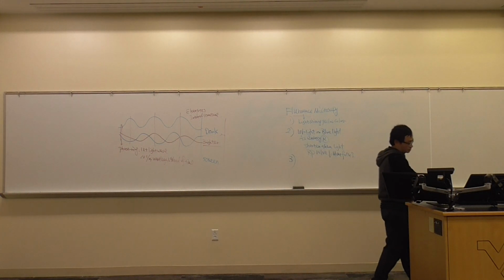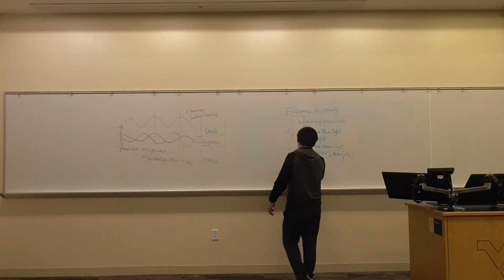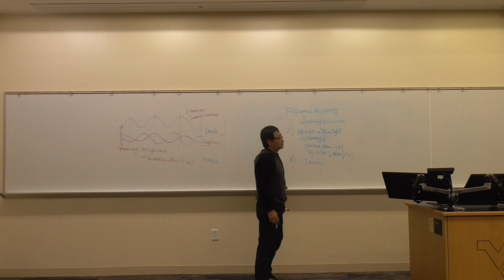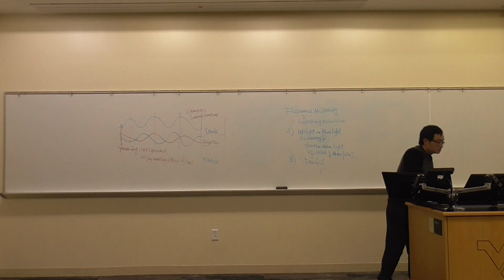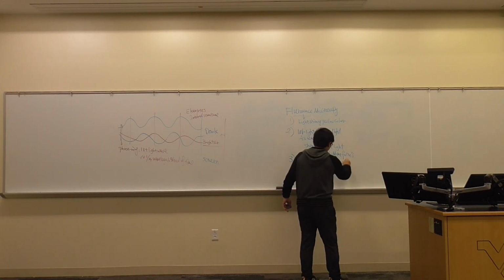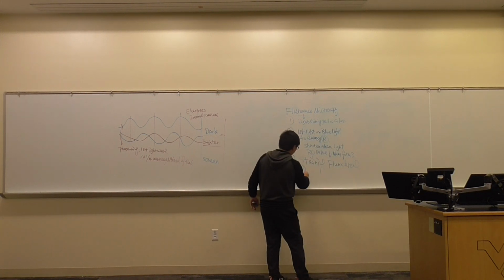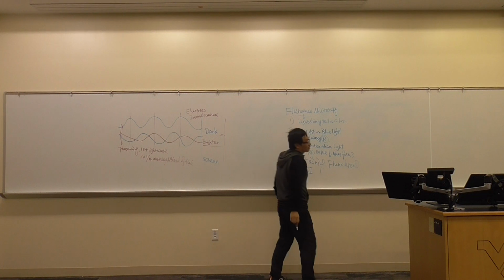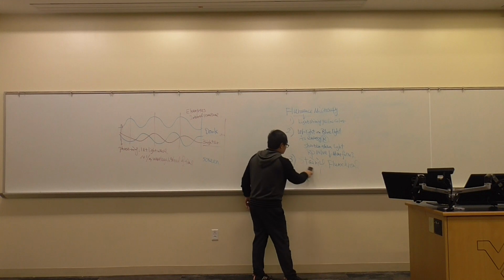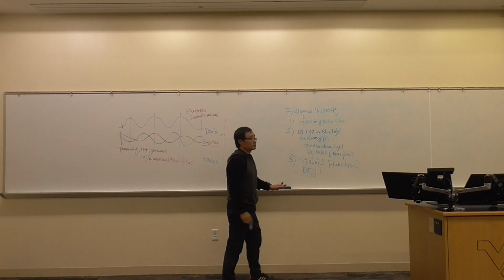The third thing I want to mention is that with a fluorescence microscope, you need to do staining. But this staining is a very special stain. We're using a chemical called a fluorochrome. The very typical commercial one we're using is called DAPI. Let me make sure it's spelled right. Yeah, DAPI. It's a DAPI stain. What's its function?